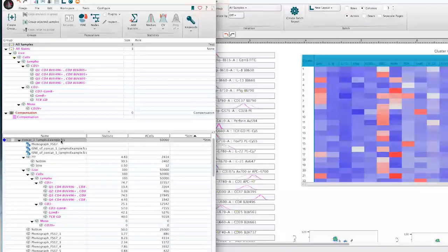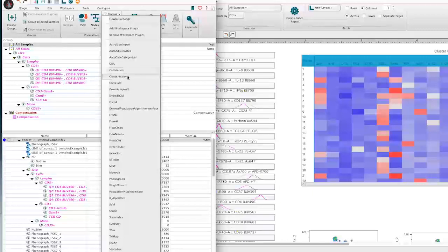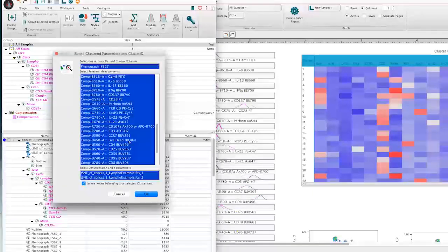Relative expression transformed. How is the signal transformed? Okay, so when she's asking specifically about relative expression, what I mean by transforming is that that visualization is binning the data. So let's spin it up once more just to see that. It is all relative.